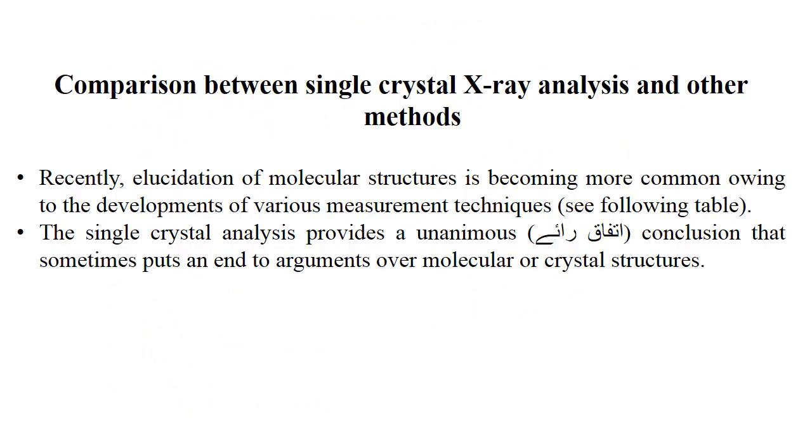The comparison between single crystal X-ray analysis and other methods. Recently, elucidation of molecular structures is becoming more common owing to the developments of various measurement techniques.